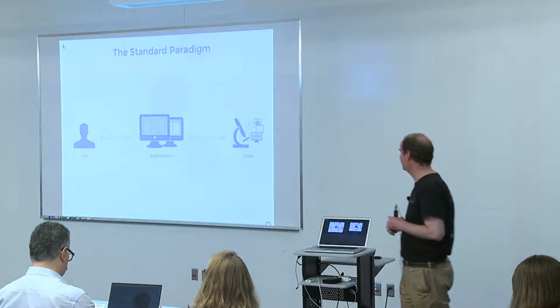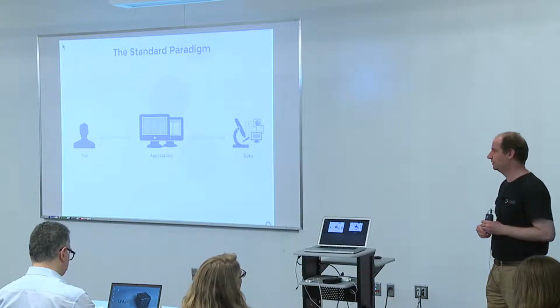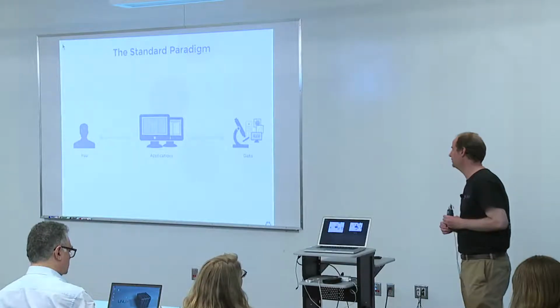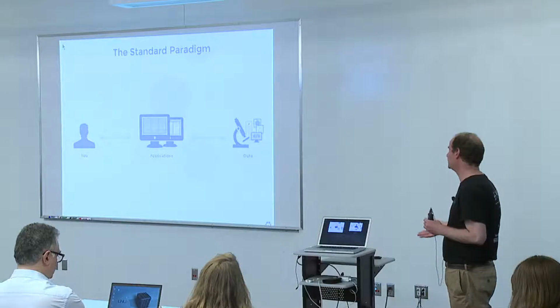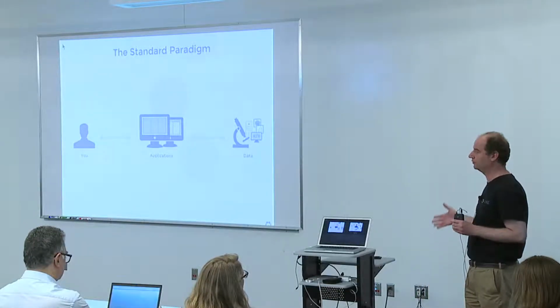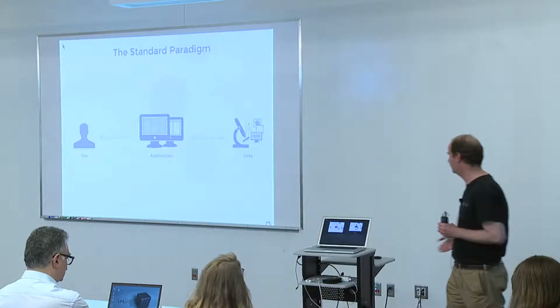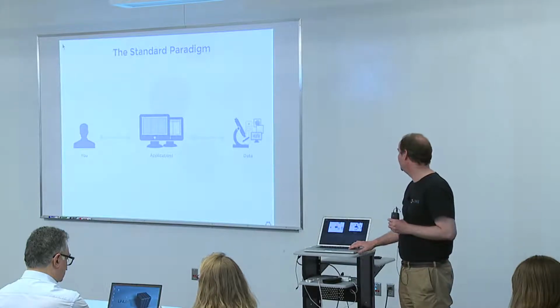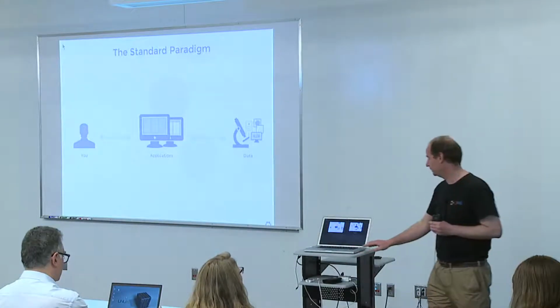What we are trying to come up with is an answer for questions like, what do I do if my data get bigger and bigger, which is nowadays, of course, very important. And bigger means not necessarily the size in gigabytes, but the heterogeneity and the complexity in regions like light sheet microscopy or super resolution microscopy.